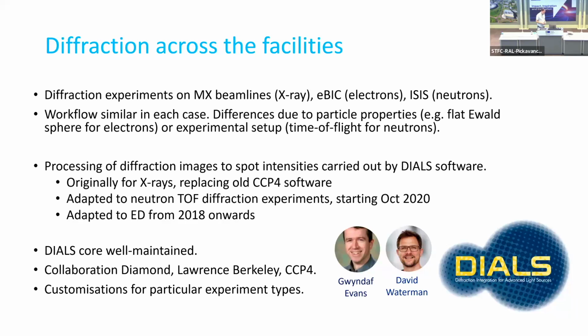DIALS was conceived many years ago, 12, 15 years ago, as a replacement for a CCP4 program, which was getting long in the tooth. So it was conceived as a kind of new next generation software suite for X-ray diffraction processing.